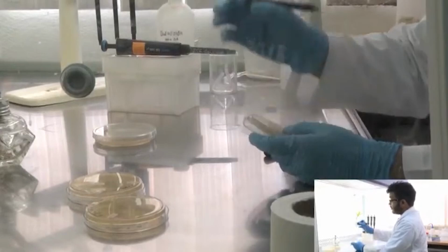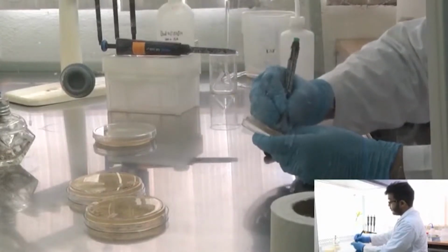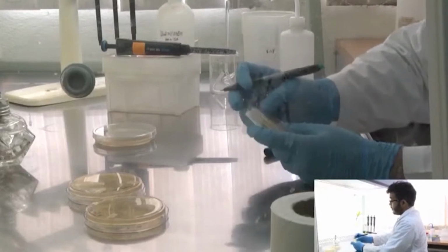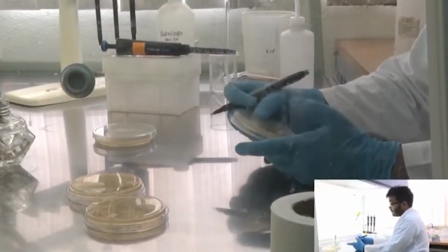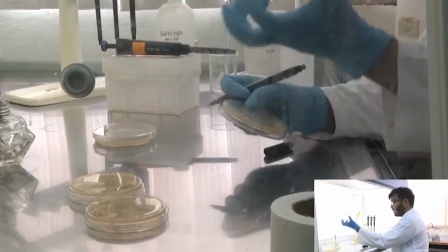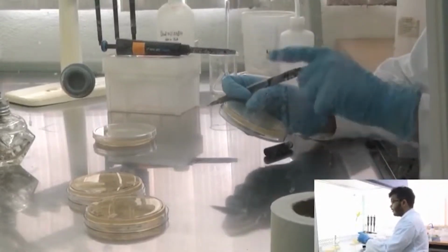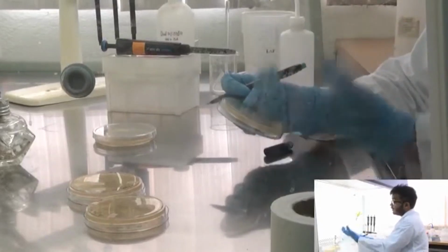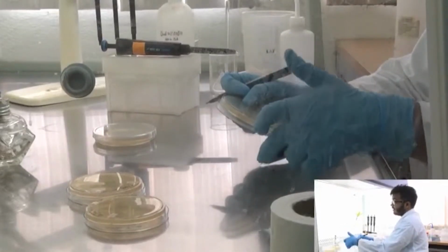This is because the gene of interest is in a particular vector, and that vector has an antibiotic resistance marker. So the bacteria which have successfully taken up the DNA will be able to survive in the corresponding antibiotic, and hence they will be able to grow in LB agar plates containing that antibiotic.